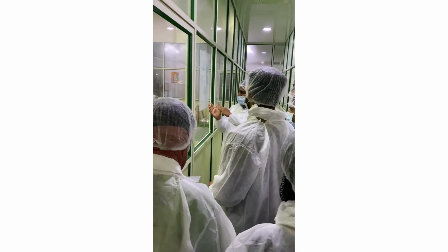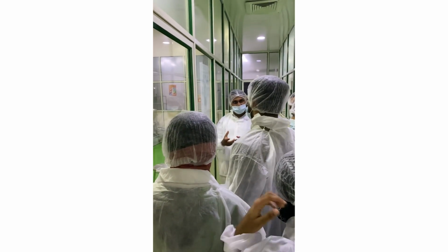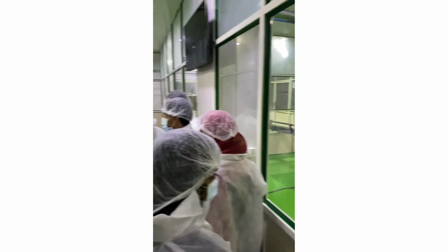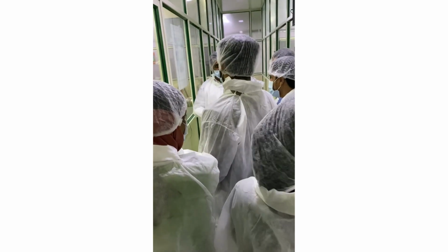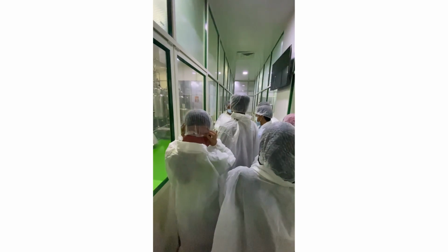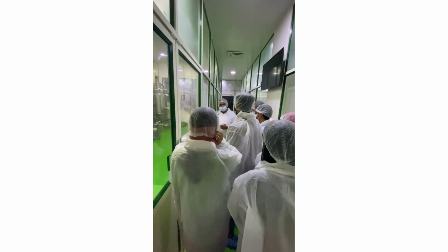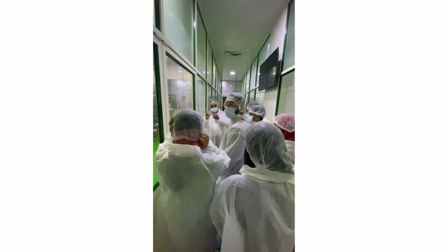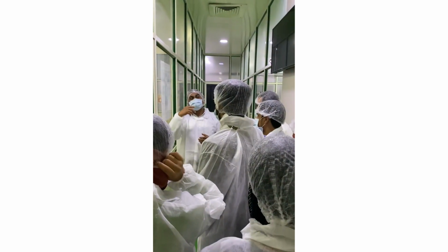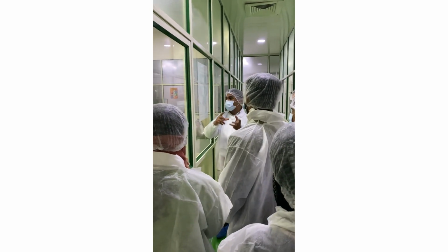Before adding, the RO water and all the raw materials are analyzed. We get a clearance from the QC, QA, and micro department. We have a store department, a microbiology department, a quality control department, and a quality assurance department. All those teams are in place. They analyze all the raw materials, and then they give a clearance. Once the clearance is given, we dispense the raw material to production.